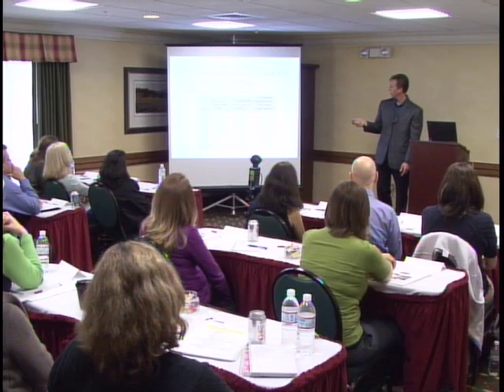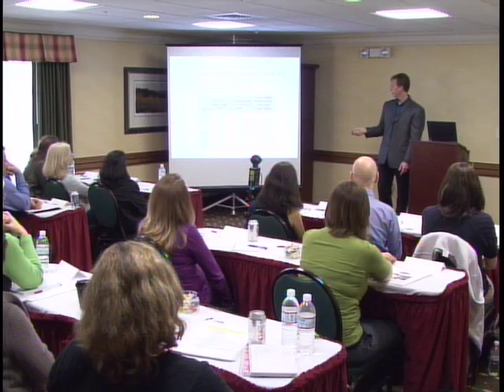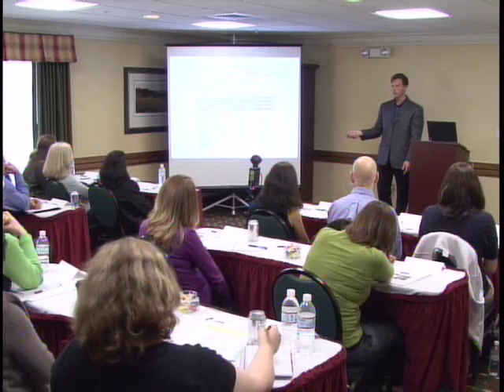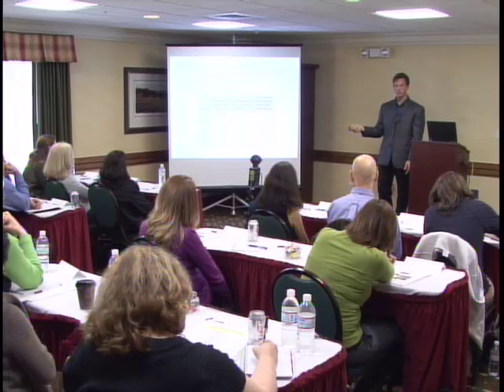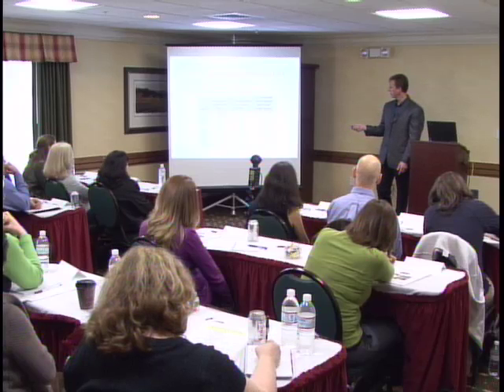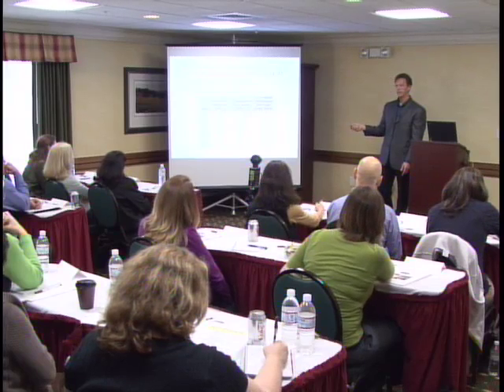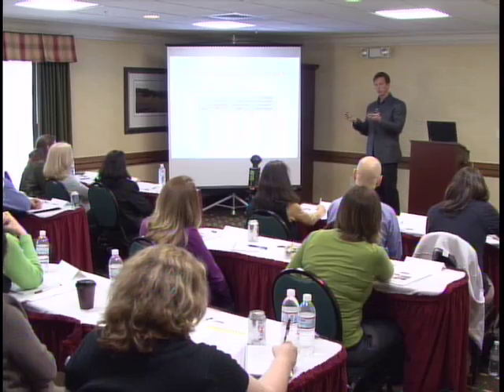And we've seen polymorphisms now in 11 of the 13 core loci. Some of them are very rare. We don't see them very much. We've only seen a couple here in CSF. But in 2 of the loci, they're very frequent. And in each case where we see them, we've seen up to 10% almost same-length heterozygous, where they wouldn't be seen as heterozygous if you couldn't tell the difference between polymorphic alleles.